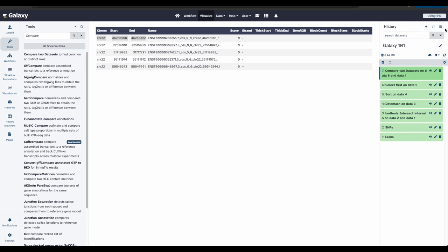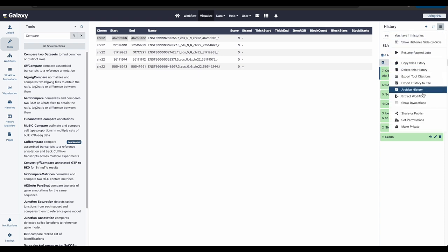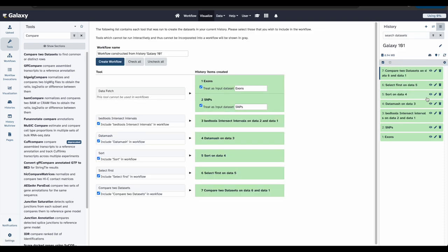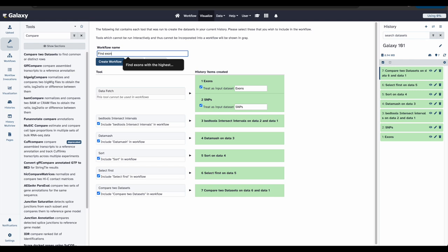To extract your workflow, click on the three lines on the right in your history column called History Options to expand and then go down to click Extract Workflow. The center panel will show the content of the history with the oldest at the top. Let's first replace the workflow name to something more descriptive. For this tutorial, let's name our workflow Find Exons with the highest number of features. If there happen to be any steps that shouldn't be included in the workflow, you can uncheck them in the first column of the boxes. But for now, we want all of our steps, so we will leave them as selected.